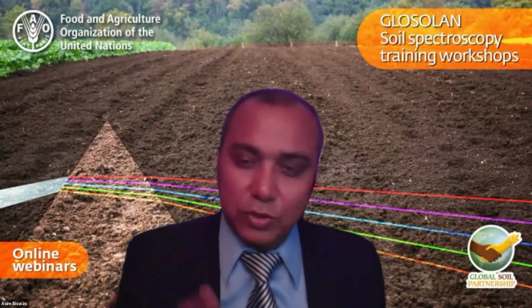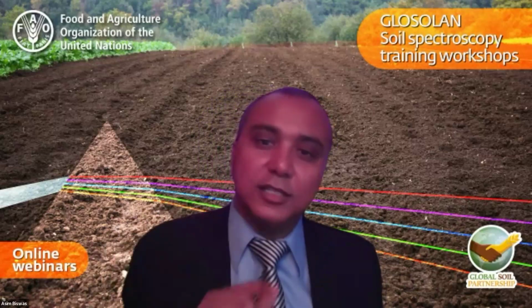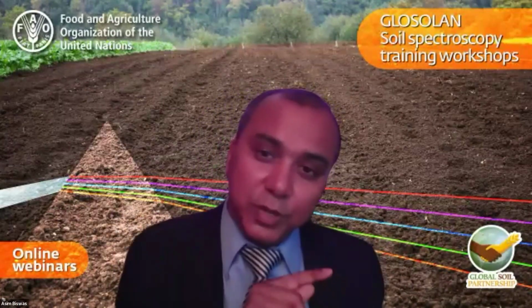In the same way, there are variations from the source, the tools you are using, different energy sources, power and all those things. If you can be consistent on that, I think that is good enough to actually detect small-scale changes. But even if we can detect those changes, we are trying to predict them back against the lab data, which already has uncertainty in it. So how do we want to see that? We want to generate an uncertainty from uncertain data. You have to keep that in mind.